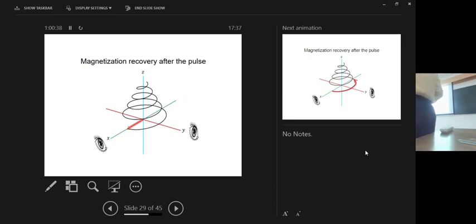Okay. Now, if there are many frequencies in this one, because as I said, all the spins individually have different frequencies. Therefore, when they go back here, they will go with their characteristic frequencies. Omega 1, omega 2, omega 3, omega 4, omega 5, omega 6. You have 100 frequencies. All of these 100 will go with their characteristic frequencies. And they all will induce current here, and their voltages will be different. So therefore, the signal that will come here will be a kind of a sum of the signals from all these rotations. Okay, what does that mean?